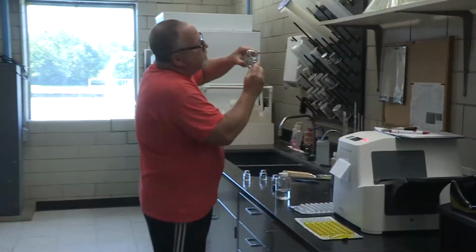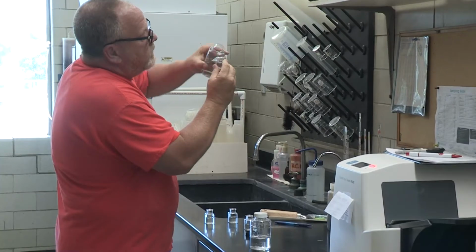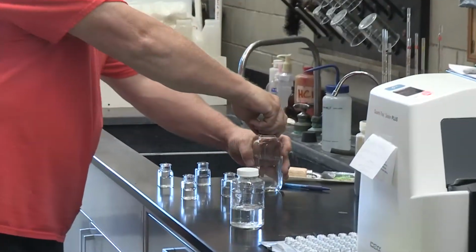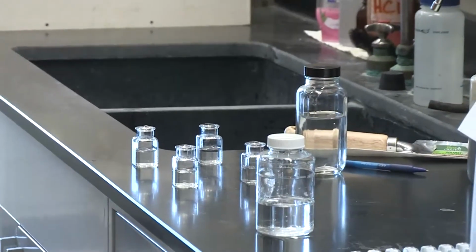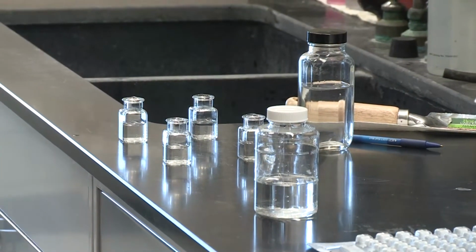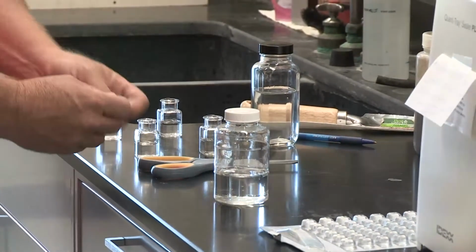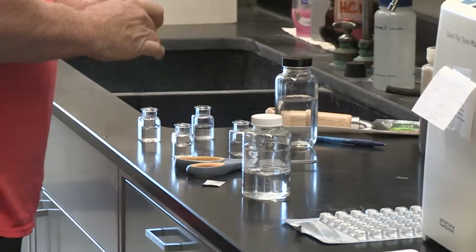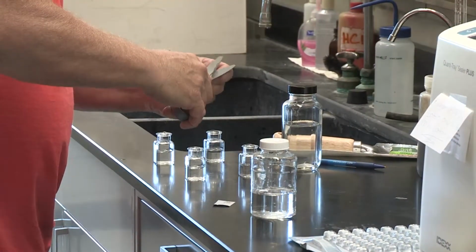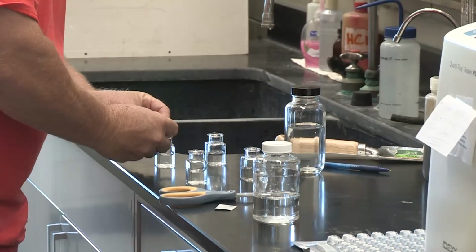So we use chlorine to help make sure that our water is clean and that there isn't any bad bacteria, so small little bugs in the water that could hurt the river or hurt people that are in the river. And so he is testing to make sure that we use a chemical that takes the chlorine back out. So we don't want to return the chlorine to the river and cause a problem in the river. We don't want to kill any fish or anything with what we're treating here. So we're testing right now to make sure that the chlorine has come back out.